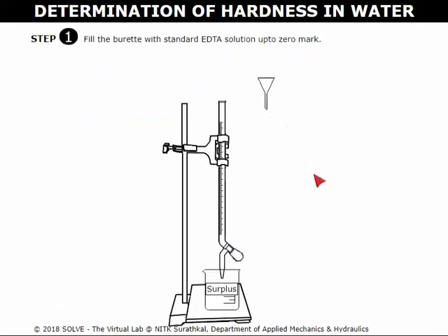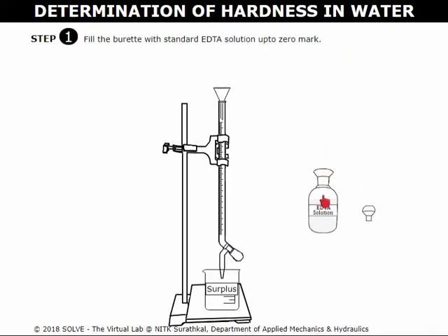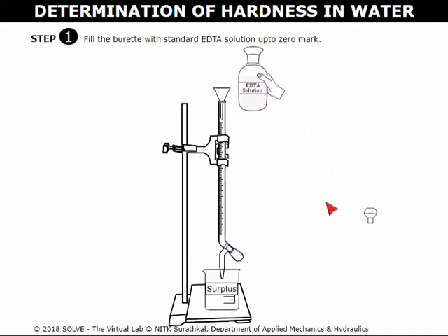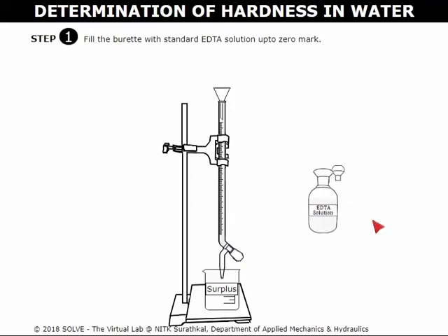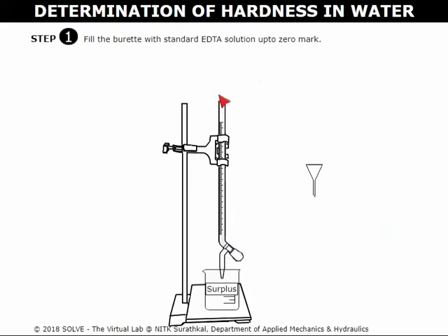Click here to place the funnel into the burette. Open the lid of EDTA solution. Click here to transfer the solution into the burette up to zero mark. Click here to close the lid.